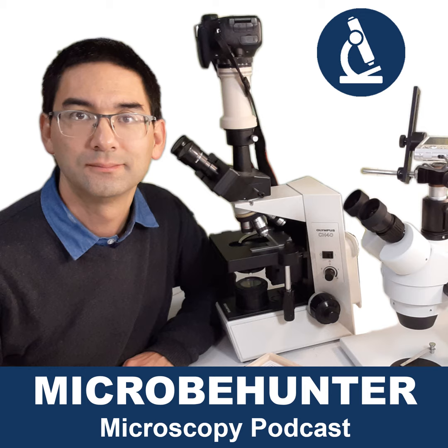The eyepiece is the lens that you look through, and the objective is the lens that you put above the specimen. Both of them have that. However, the two microscopes are optimized for different specimen types, and that is the point of this episode, that I explain the differences to you a little bit.